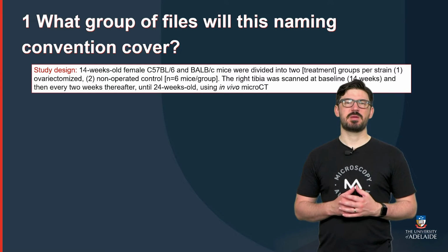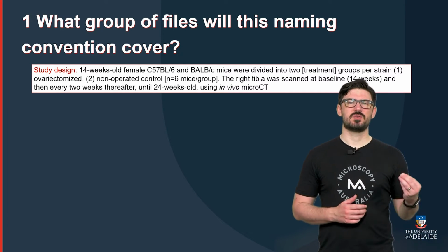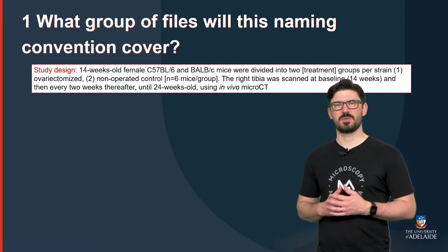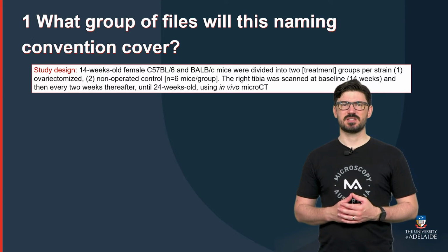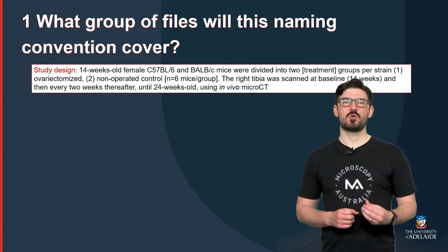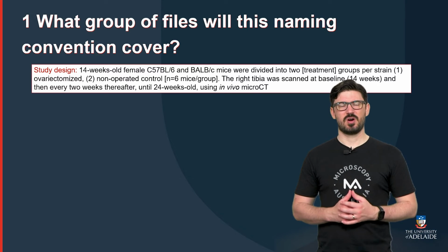Often, a specimen may be imaged using different microscopes, so it is useful to know whether we use a single naming convention for images from different microscopy systems, and whether to include microscope information in the file name. If you're doing quantitative image analysis, often new images are going to be created from the raw image data at different processing steps, and therefore we need to decide whether the convention is recycled for each version of our image files.